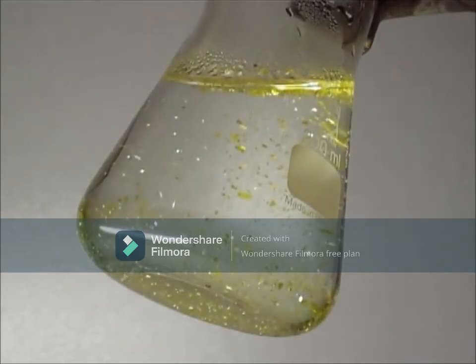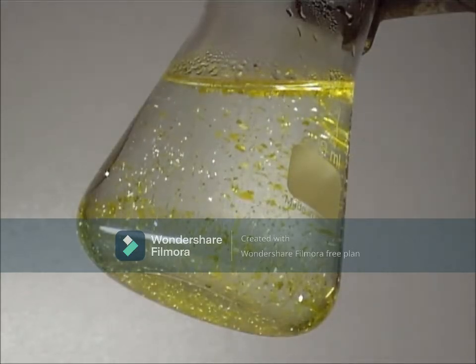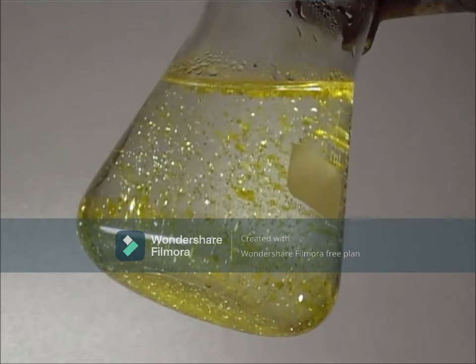And this is the golden rain phenomenon. The compound that formed these crystals is the same, lead-2 iodide, but in a different form from what we observed earlier.